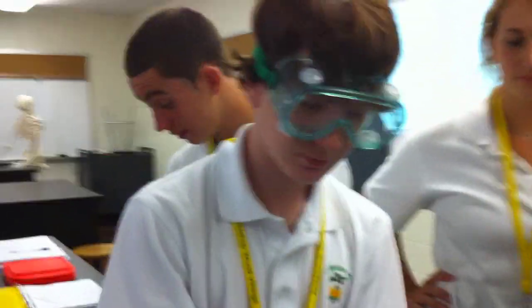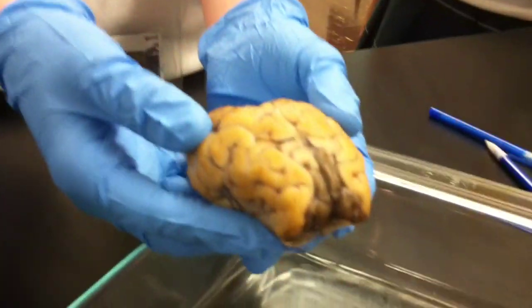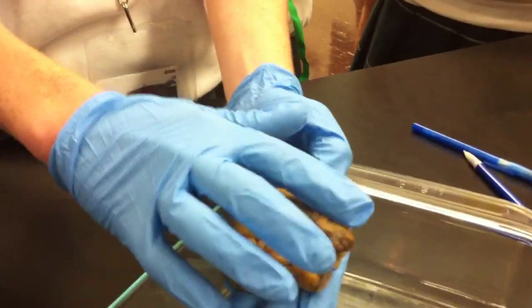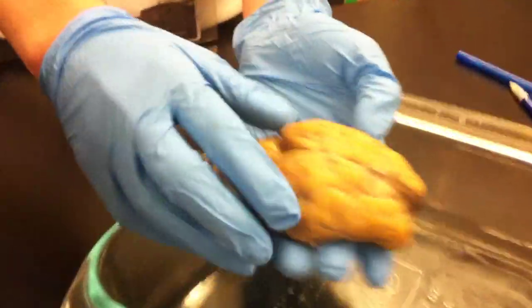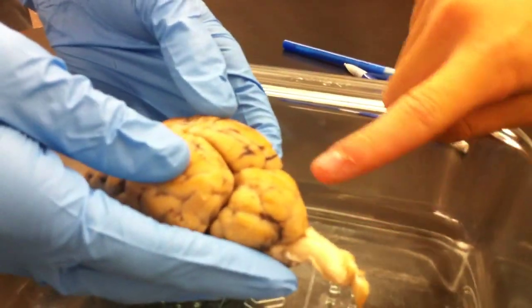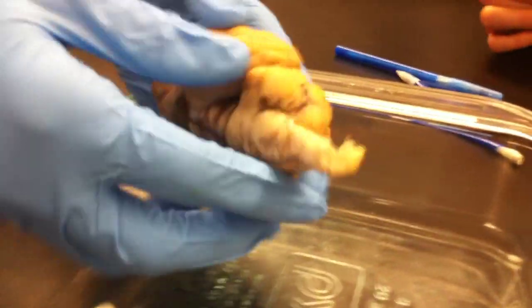What are you doing actually right now? We are examining the brain and comparing it to the human brain. Can you just show me some of those parts? Sure. This is the frontal lobe of the brain. Right there is the brain stem, which connects to the spinal cord. You can see that on the bottom there.